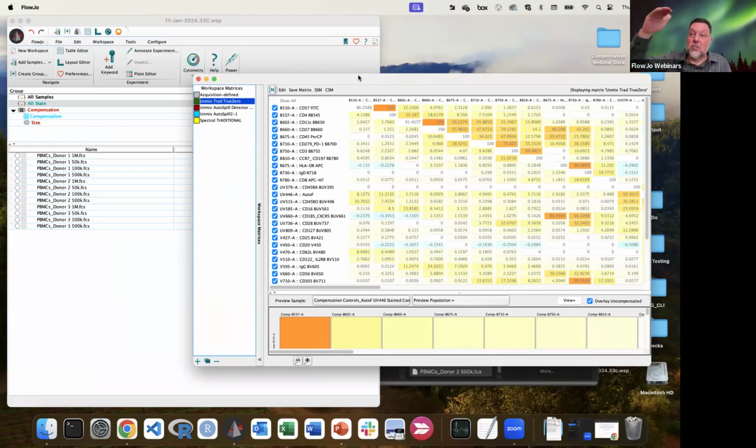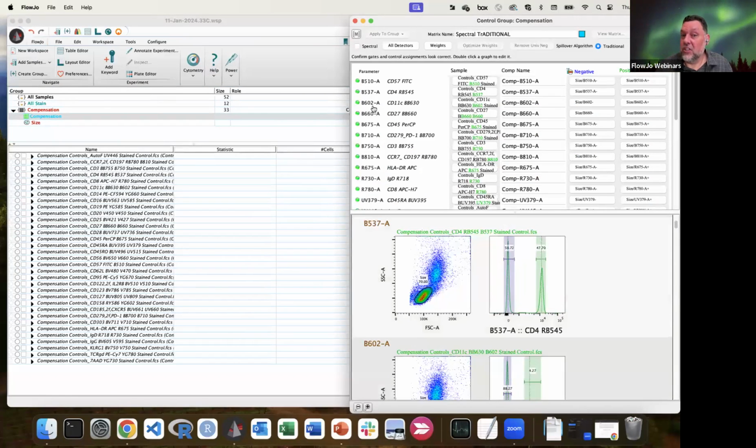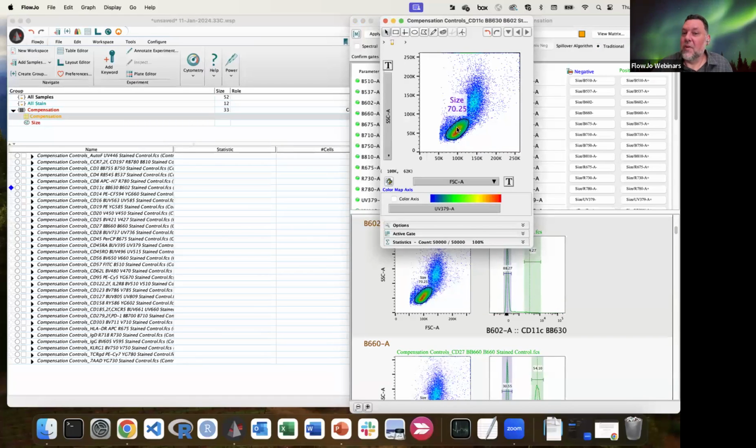Start with all detectors, remove the ones that you aren't using as primaries one by one, and verify the positive and negative fractions for each channel, right? And you can just do that by clicking. Everything looks pretty good. Again, this one, I hadn't set it up right. It would be better. It always helps to look again.